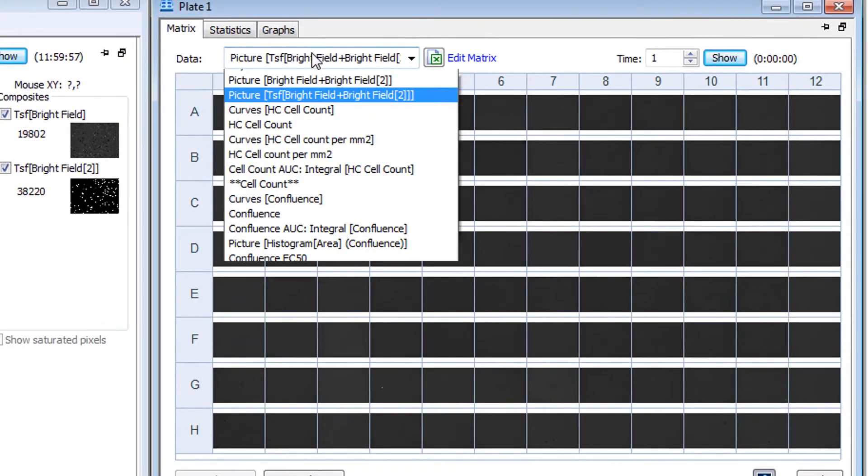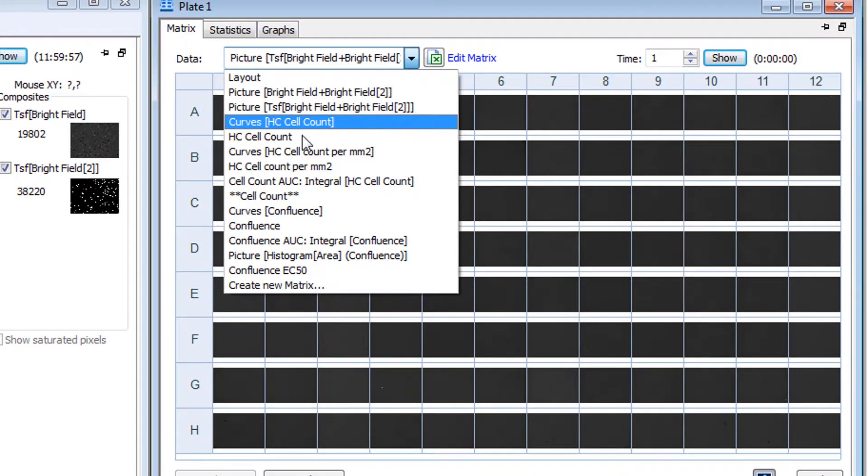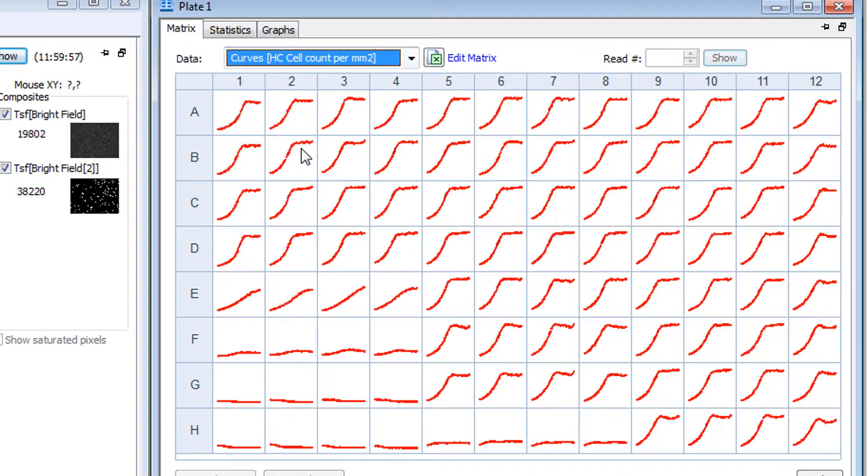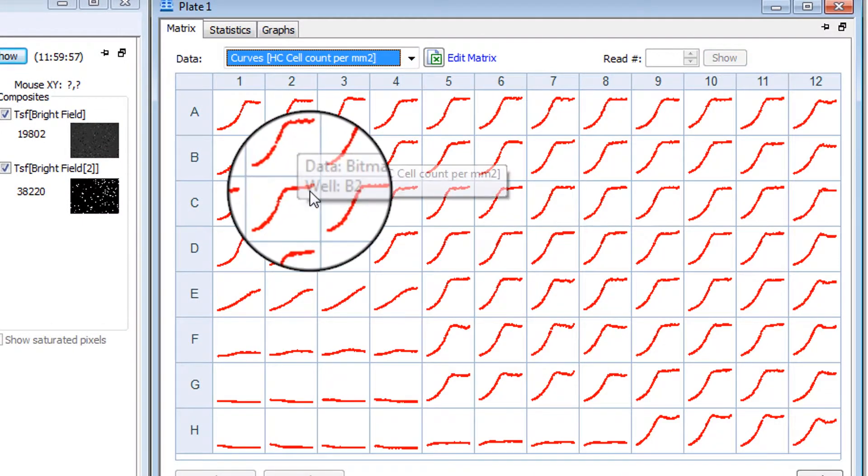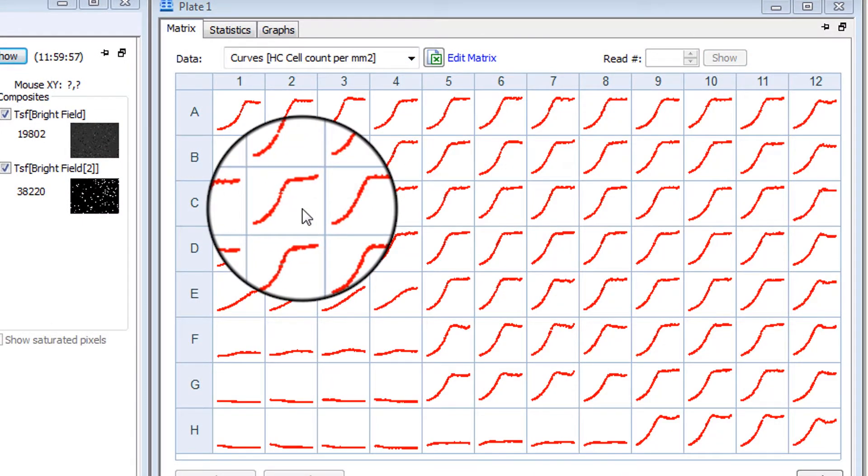With analysis complete, the cell count and other data is ready for the next step in your workflow.